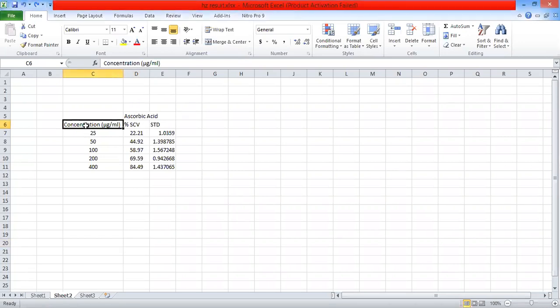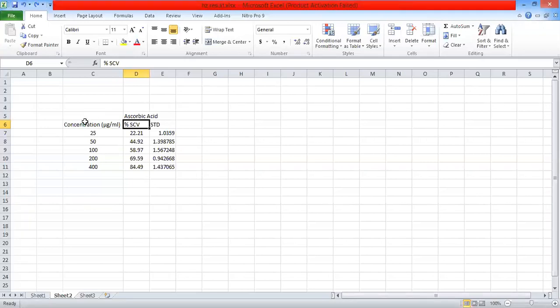For today's tutorial, we are using this data. We have the percent scavenging rate and the concentration of the extract or standard. You can see that the percent scavenging rate shows that the IC50 value lies between the concentration of 50 and 100 — that means between 50 micrograms per ml and 100 micrograms per ml where 50% inhibition is accomplished.